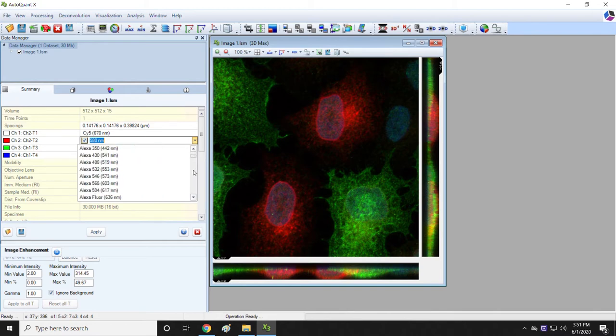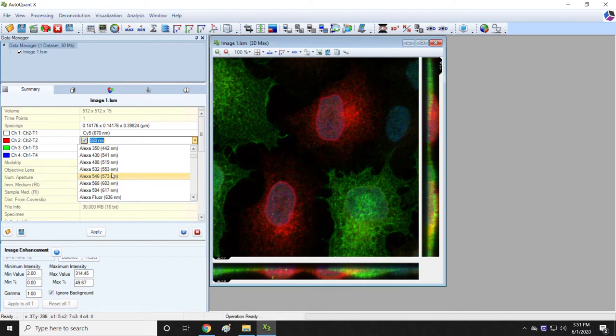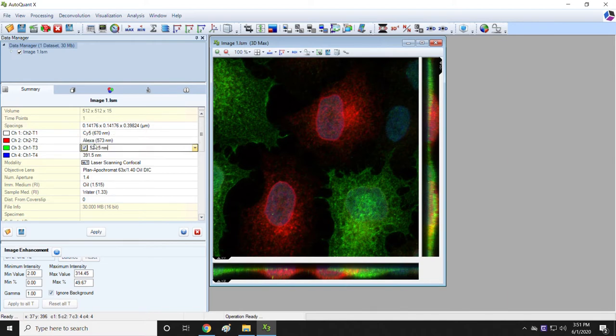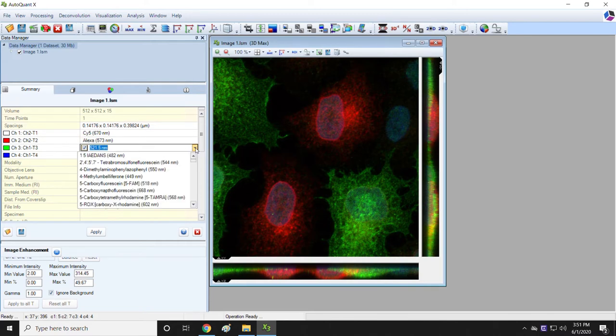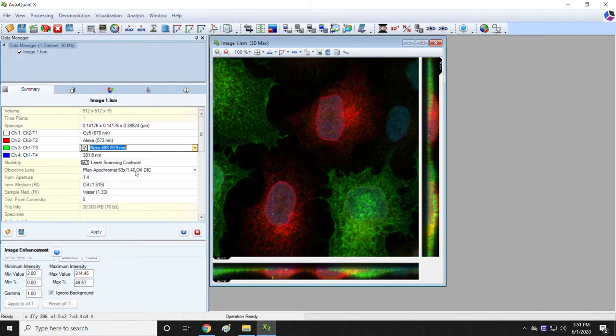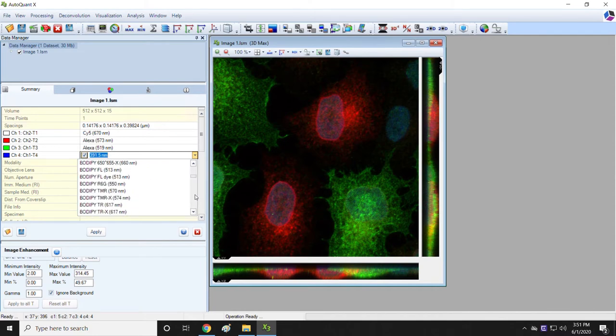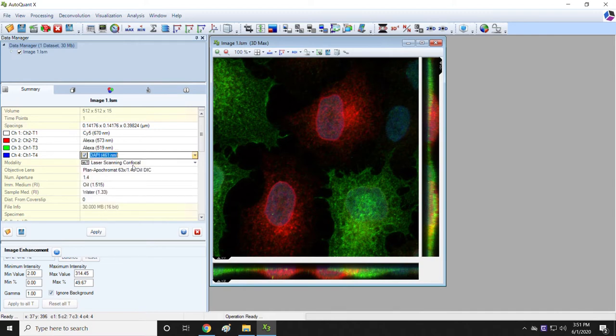The second one I said was Alexa Fluor 546. Let me find that one in this list. Sometimes they're called Alexa 546, sometimes they're called Alexa Fluor 546, so you may have to look a little bit. One thing that's a little bit annoying about the software is when you click on Alexa 546, you can see it says Alexa 546. The important number is what's in parentheses. That's the emission peak of this dye. But you can see if I click somewhere else, the 546 disappears. That's a little bit confusing. Which Alexa was it? Well, you're just going to have to trust that it's the one that you chose. And if you have any doubts, you'll have to go back and check. Then the green channel is Alexa Fluor 488. The blue channel in this particular experiment was DAPI. The DAPI emission peak is 461 nanometers.